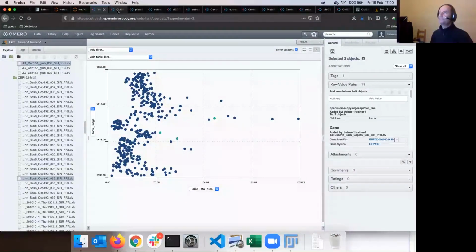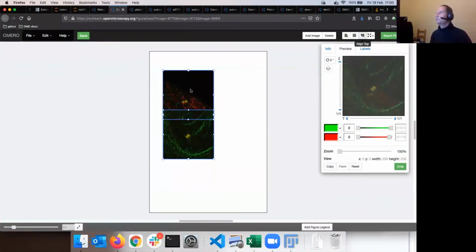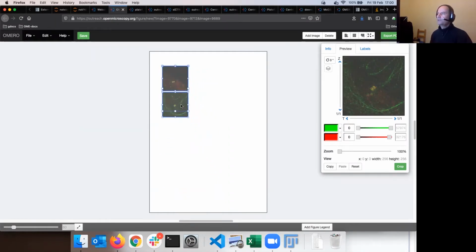It's the same thing. The result will be the same. So I snap to grid those 2 images, then make them a little bit smaller. Okay, and then do just the usual trick.